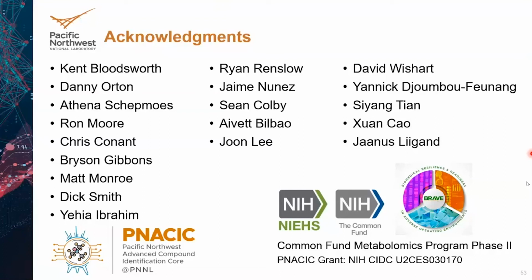The proteomics community has had it easy, I would say, through the years, just because of the nature of the molecules involved and the nice tools that have been developed. They can do things like looking at extended gradients and offline fractionation or enrichment techniques, so on and so forth, to see how those types of analytical improvements impact the quality of the proteomics data. I would argue we can't really do that right now with metabolomics because we just simply can't identify the majority of the data.